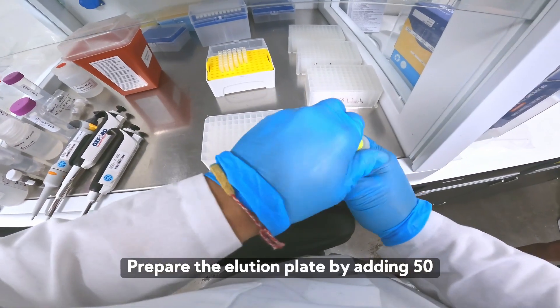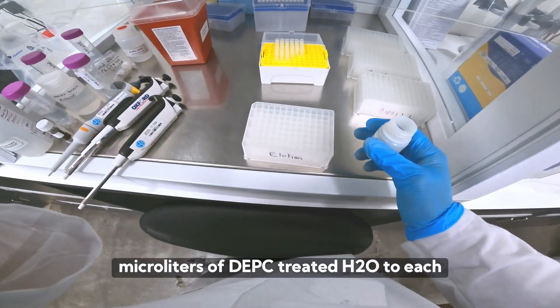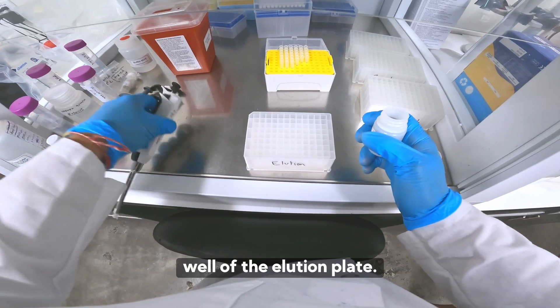Prepare the elution plate by adding 50 microliters of DEPC treated H2O to each well of the elution plate.